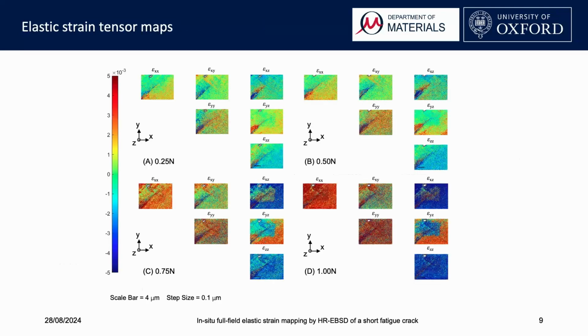So this slide illustrates the elastic strain tensor maps obtained by our calculation. As you can see, as the applied load increases, the magnitude of the strain field data also increases, with localized strain concentrations occurring close to the crack.